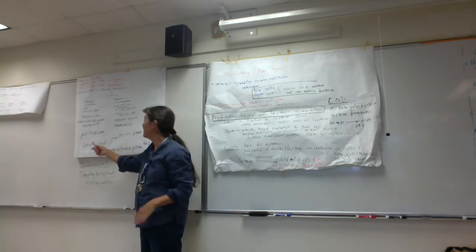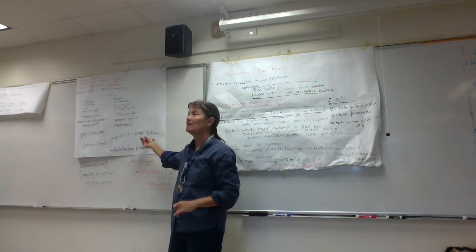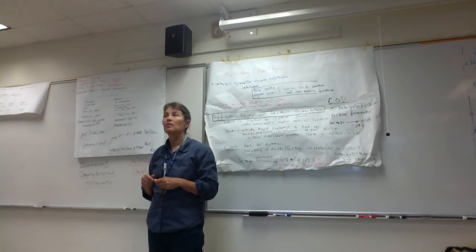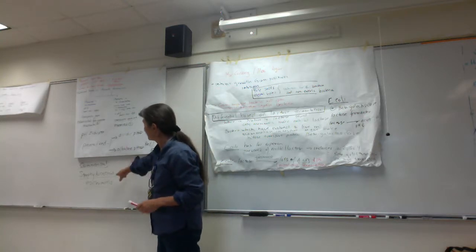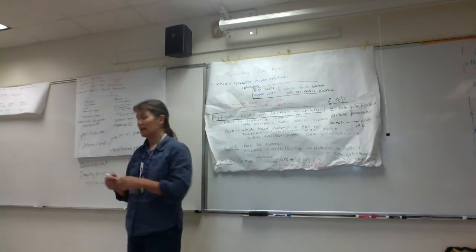I always love that. So with phenol red, at acidic pH, it turns yellow. And at alkaline pH, it'll be a dark red. Sometimes it's called fuchsia, right? So, okay, it's like, all right, so what? So it turns out Staphylococcus epidermidis cannot ferment mannitol.